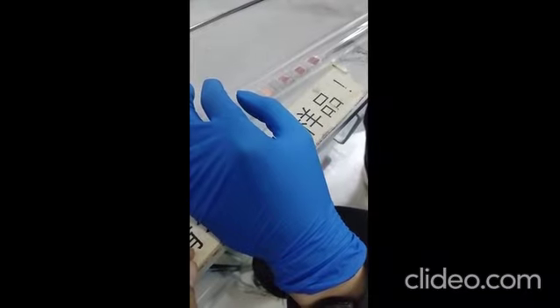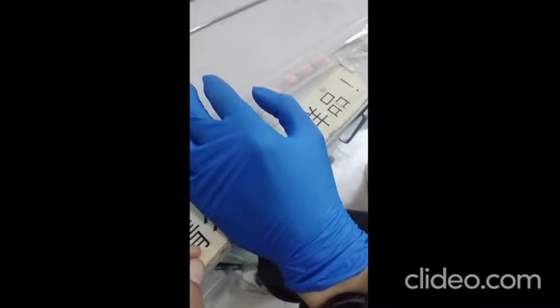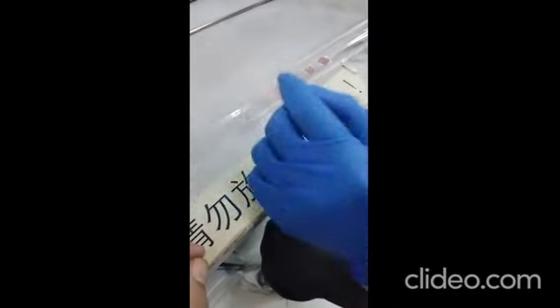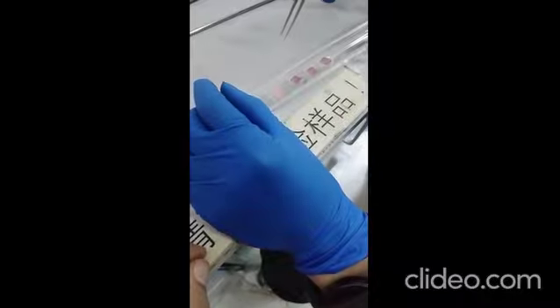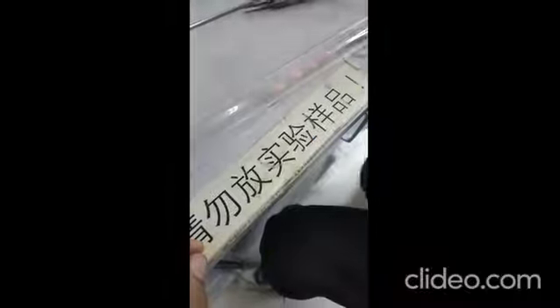This glass maybe melt a little. Yeah, under high temperature. So it broke a little.